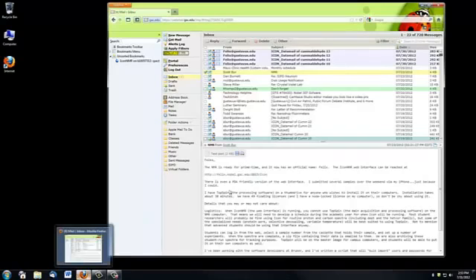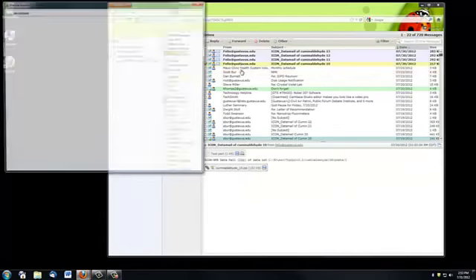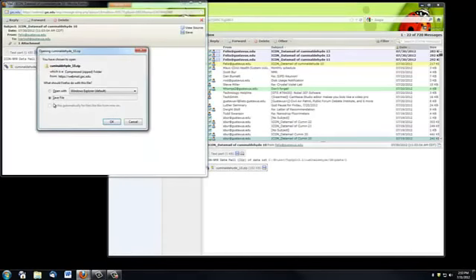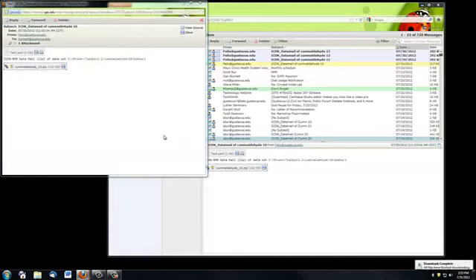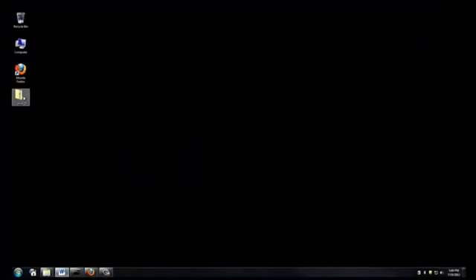So when I open my email, I see that I have a series of messages from felix@gustavus.edu. These are automated messages sent from the NMR. If I click on this message here and save the file, I prefer to save these to the desktop so that they're easy to find later. And here it is, the zip file.